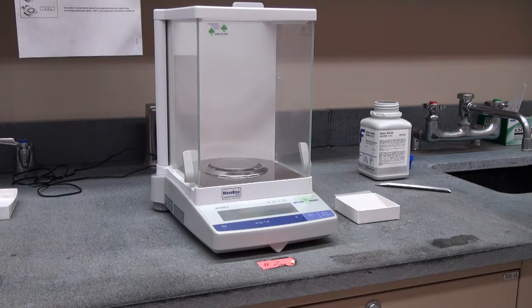Because of its accuracy, we want to be very careful how we behave around an analytical balance. We should avoid leaning on the bench top, and the balance itself is sensitive to drafts, so you'll see that the balance pan is enclosed in a glass case with drawers.